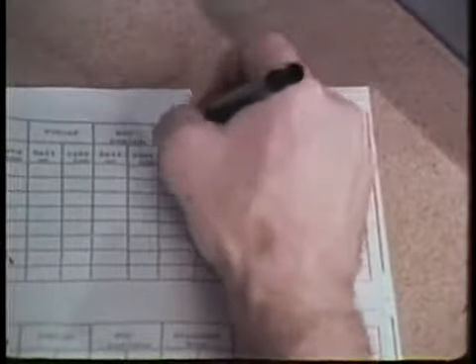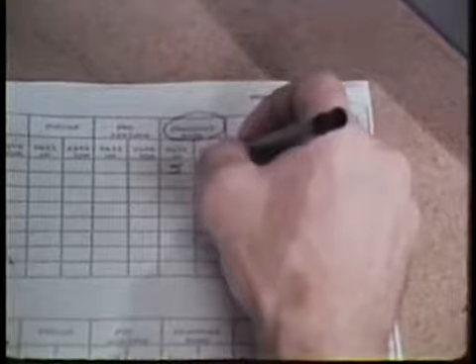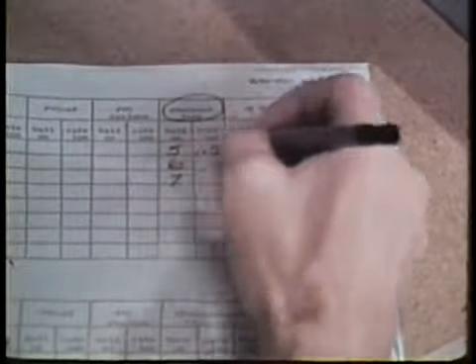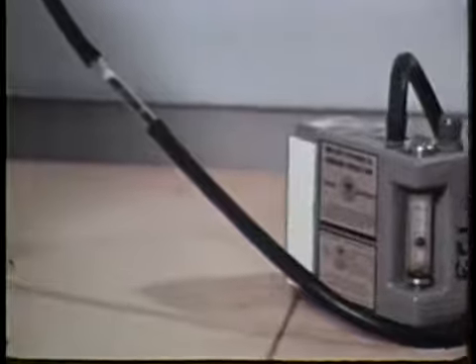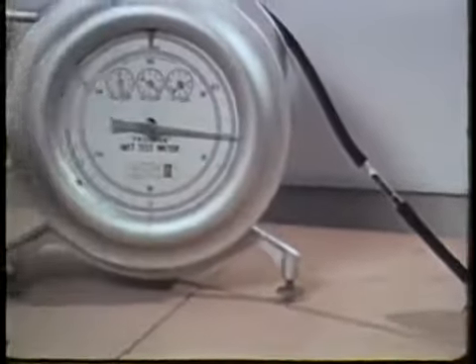You should maintain a separate calibration chart for each pump. Before every survey, each air pump should be recalibrated and a new flow rate chart prepared. You can also calibrate the pumps with a wet test meter, which gives a direct reading of the air volume pumped in a given length of time.